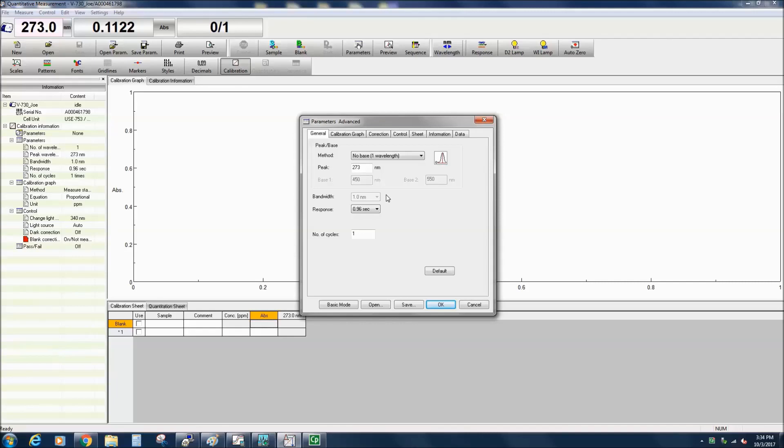The V750, 760, 770, and 780 all allow for the bandwidth to be varied, and if you are using one of these instruments, a two nanometer bandwidth is a good starting point.